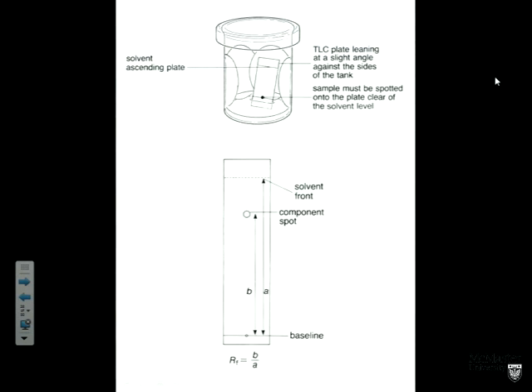We just put a tiny amount of sample, roughly speaking, less than a microgram, on the order of nanograms of compound on here. The one mistake that most students make in doing TLC the first time is that they think more is better, right? And put a gallon of compound on there. So we're aiming for maybe 100 nanograms of compound. So we can take a dilute solution of your compound in a solvent, spot it on the plate, and you really need very, very little.